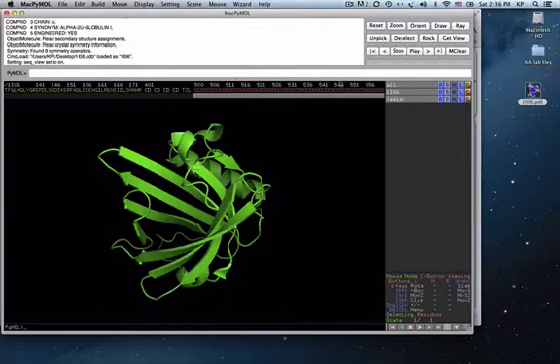So these O's are all of the waters. Remember, we can't see hydrogen atoms. The reason for this is crystallography is actually done by bombarding the crystal of a protein with X-rays. X-rays bounce off the electrons, and we generate this model. However, hydrogen only has one electron, and it cannot be seen by crystallography.